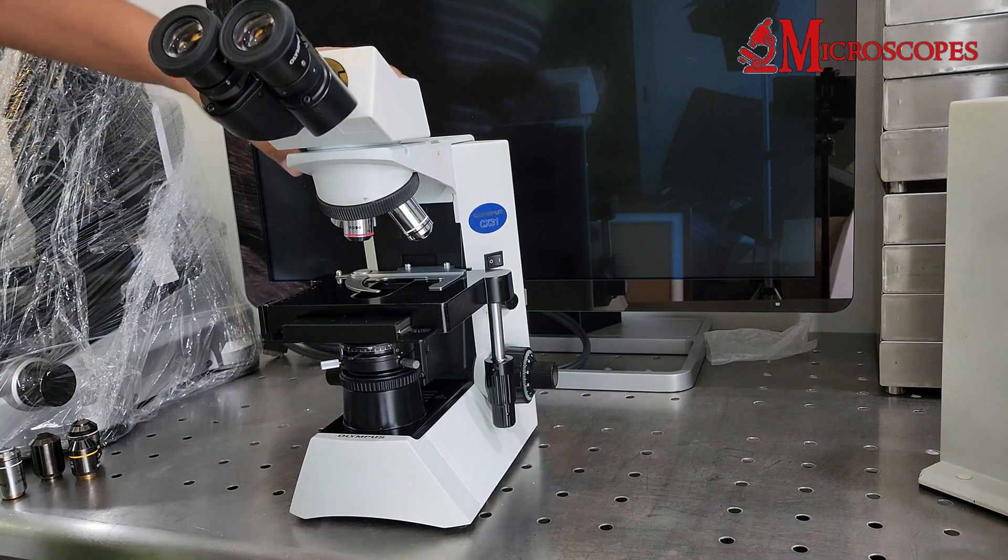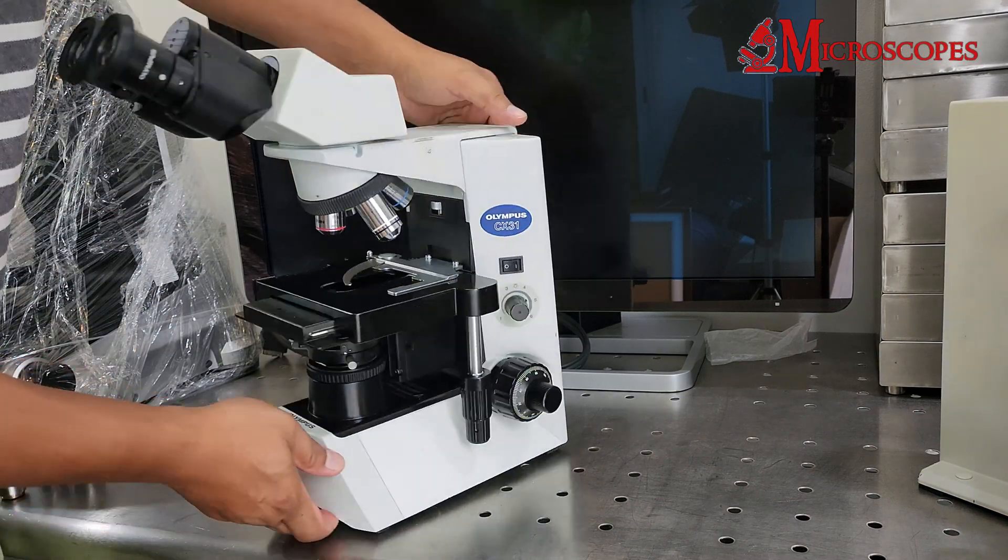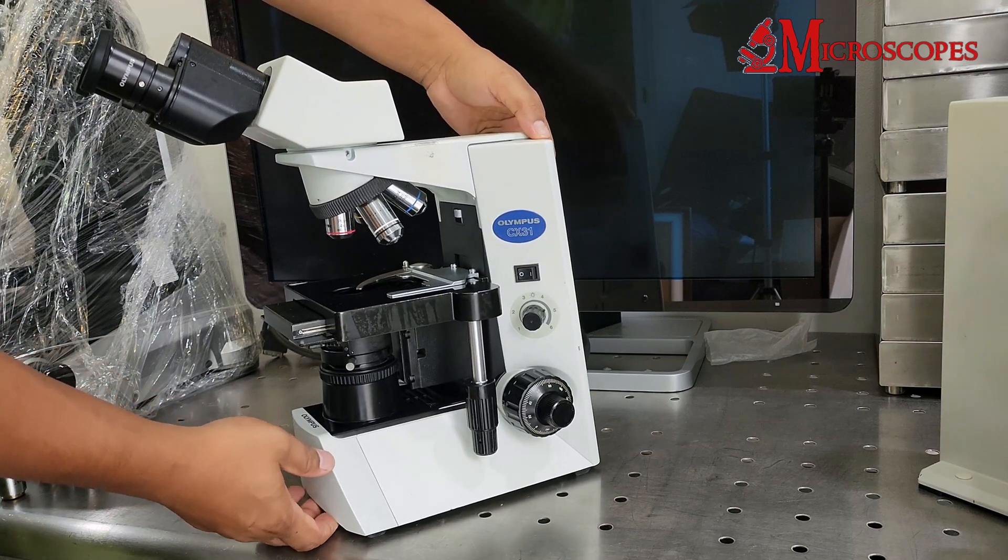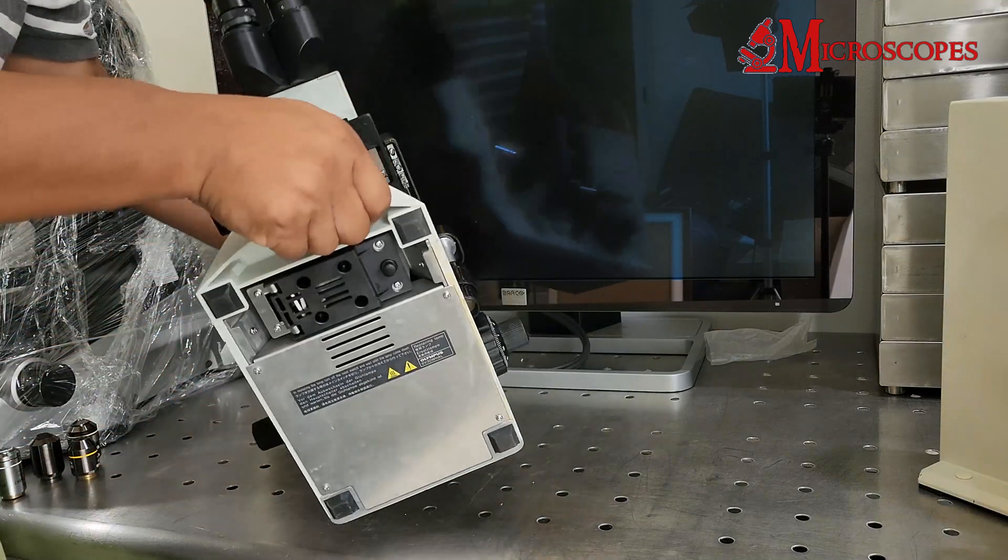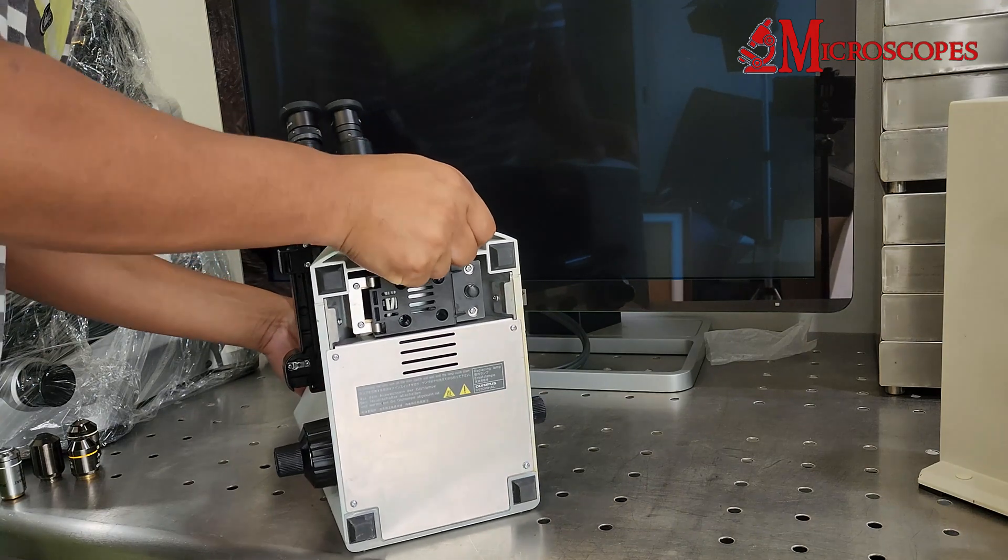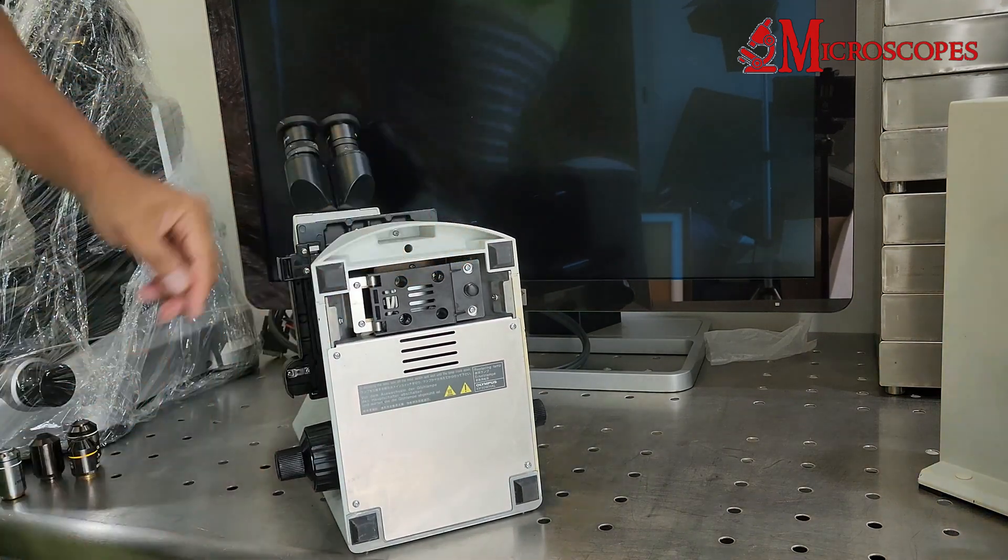How to change a halogen light bulb in an Olympus CX-31 microscope. The halogen light bulb is hidden under the base of the microscope. Lift the microscope up and follow the video.